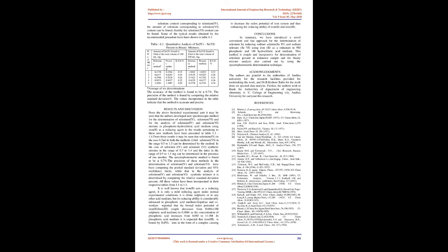6. Recommended procedure for the spectrophotometric determination of selenium(IV) and selenium(VI) present in a synthetic mixture. Synthetic mixtures consisting of selenium(IV) and selenium(VI) have been prepared in different 100 ml flasks using their respective concentrated solutions, 0.02 M, such that their total concentrations of Se(IV) and Se(VI) combined together does not exceed 0.002 M. When the solution is diluted to 100 ml, 5 different samples have been prepared in this way.